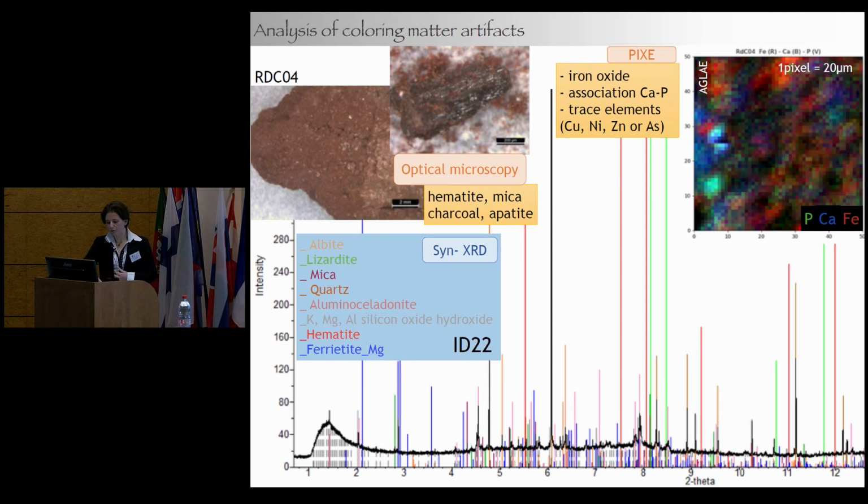And we find also a very complex mixture in this sample. It is really important to cross over different scales and different techniques to be able to reconstruct the mixture of this sample, because the charcoal is not observed by micro-XRD and not by chemical observation.